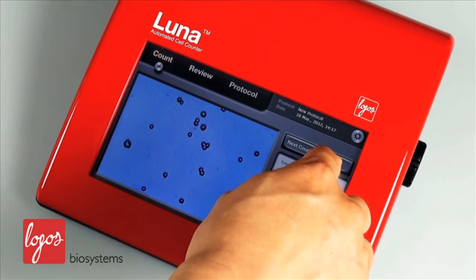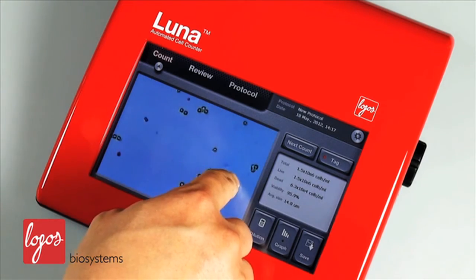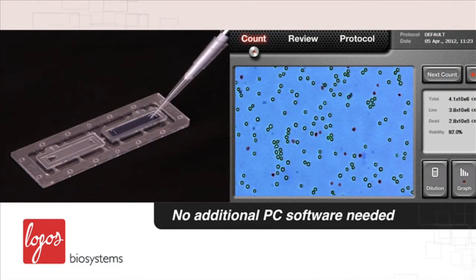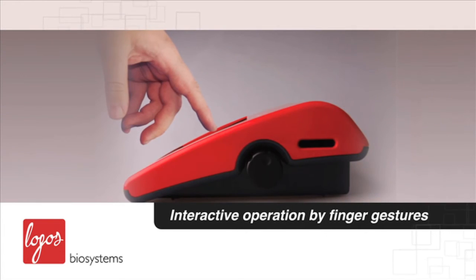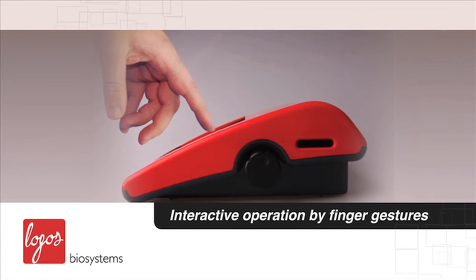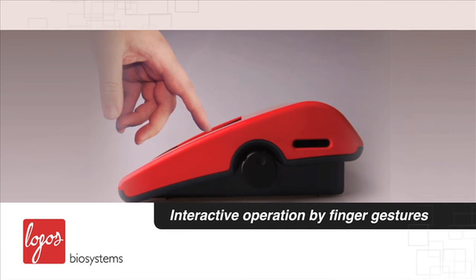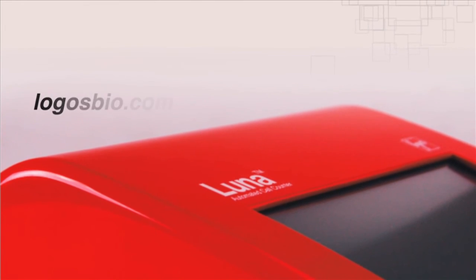After you perform the cell counting, you can immediately monitor which cells are counted as live or dead on the LUNA screen. You don't need additional PC software to check the counting results, thus saving you time and money. Plus, the LUNA's touchscreen interface allows for interactive operation by finger gestures, enabling you to easily obtain all your cell counting results.